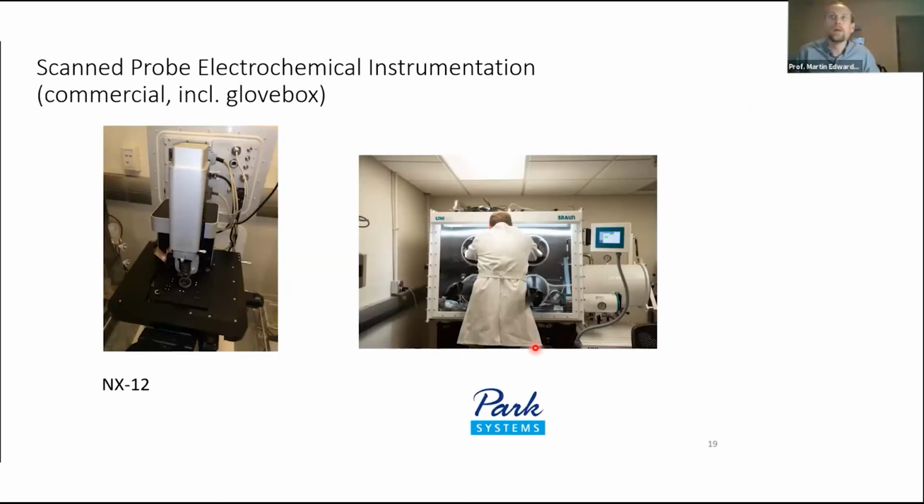There are now commercially available systems. So this is a Park NX12 in a lab when I was in Utah. We got that put inside, well, I say we, and this is really thanks to all the Park engineers in Korea who engineered it so the vibrations weren't an issue, but inside an MBraun glove box. And so for those of you thinking, is this technique compatible with batteries? Well, if they're air sensitive and moisture sensitive, sure, you need to control the environment, but that's an engineering problem, and thankfully I didn't have to solve it myself.